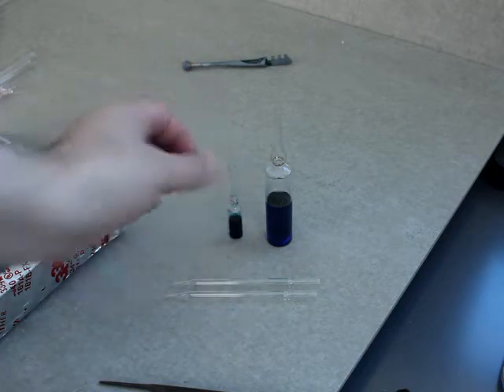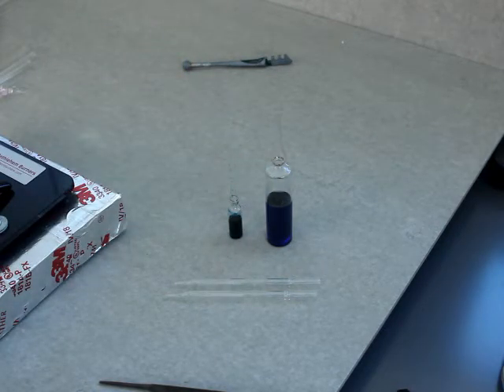I would not have wanted to explain that to my undergraduate mentor if I had essentially ruined the dry box and destroyed the very expensive deuterated acetonitrile. The ampule we had was about one milliliter and we needed about 0.7 milliliters — about 70% of it — to make the sample. So if I literally would have spilled one or two drops, it would have ruined the experiment anyway.